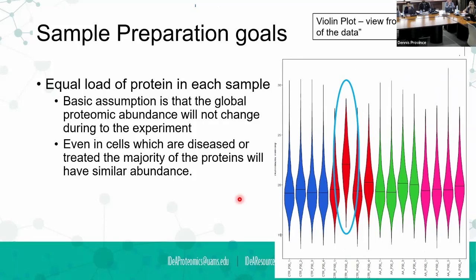That just means it's going to be harder for us to compare the biological variability between the blue samples and the red samples if there's so much variability within the red samples themselves. That would probably be thrown out. This is also why we want replicates. And if you only send us 3, there's lots of weeping and gnashing of teeth.